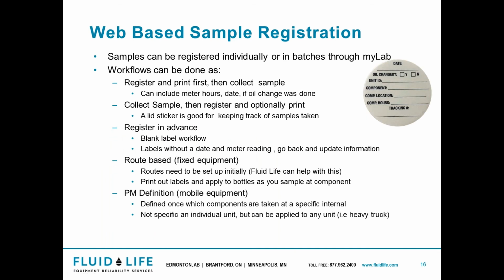So some things to remember with the web-based registration. Samples can be registered individually or in batches, like we mentioned. The workflows can be done as register your sample, then print it, and then collect the sample. Or collect the sample, then register, and then optionally print it. A lid sticker is really good for keeping track of samples.